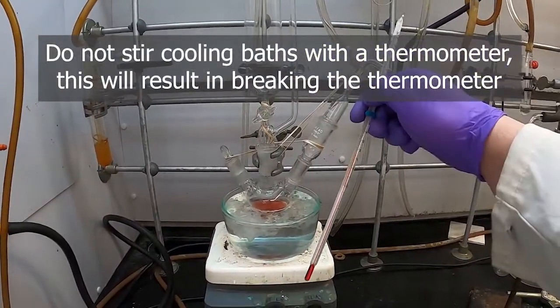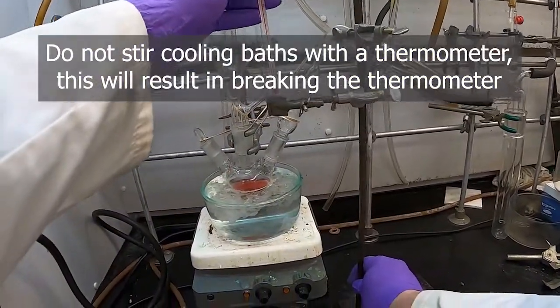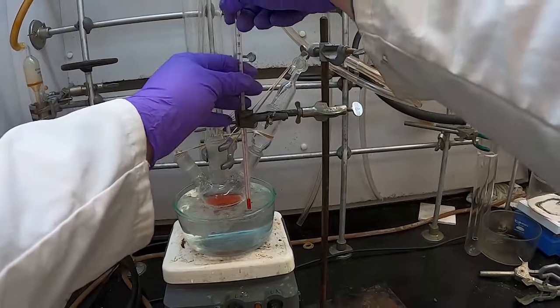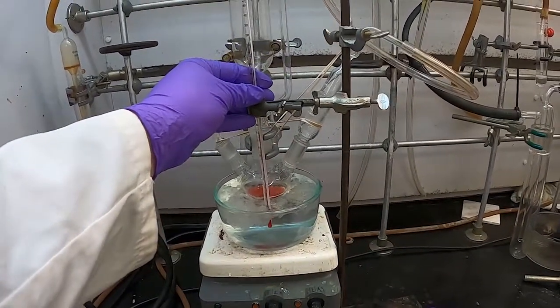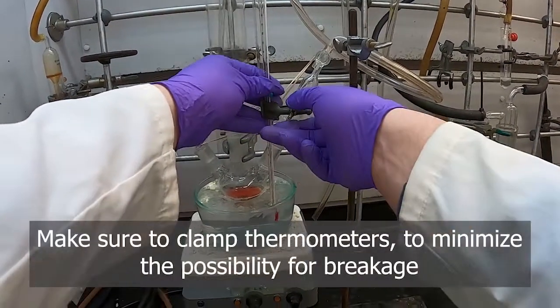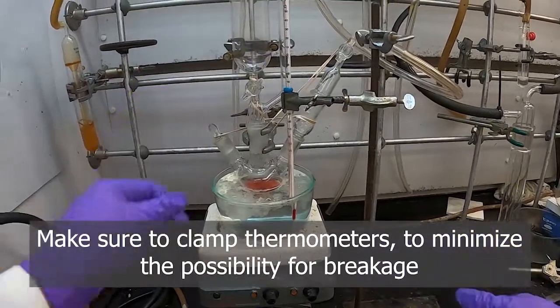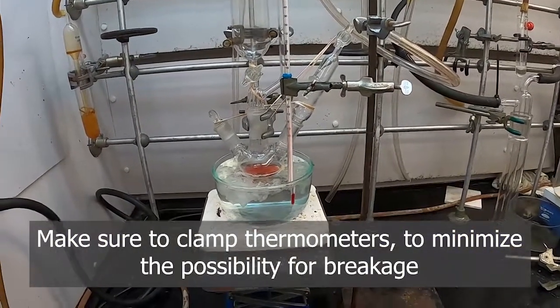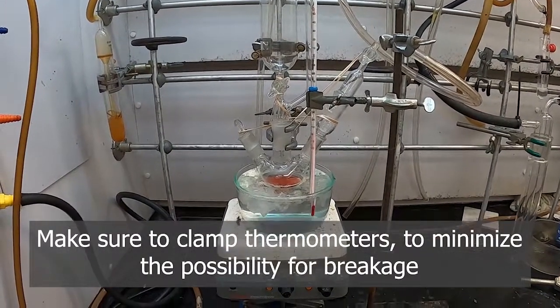We don't use thermometers to stir baths ever. Doesn't matter what kind of bath, they're just for measuring temperature. We don't want to break them and cause problems with our reaction. So we can position our thermometer in the bath here. The response on these alcohol thermometers is pretty quick. I already see it dropping.